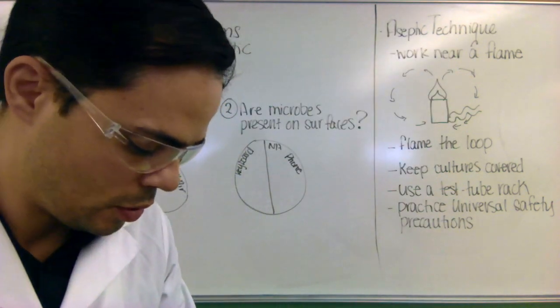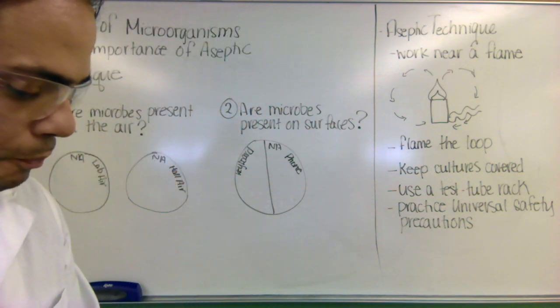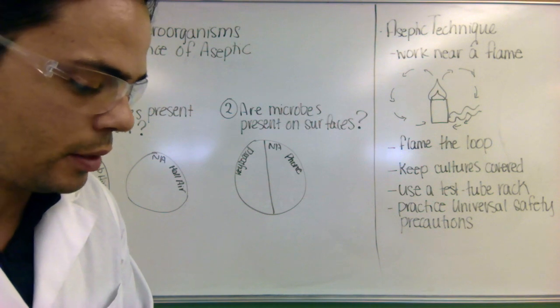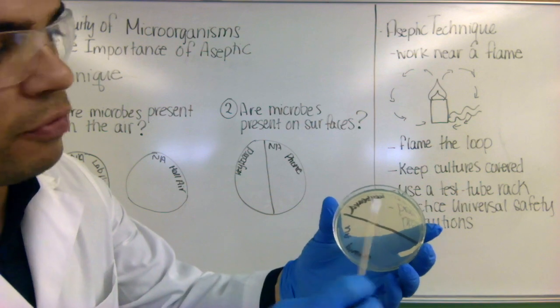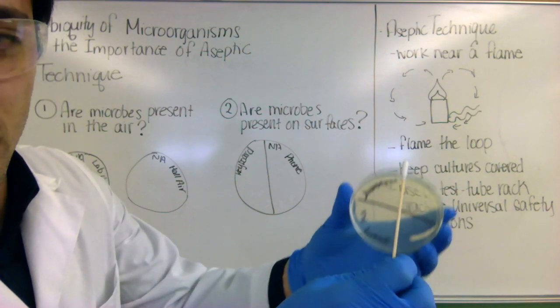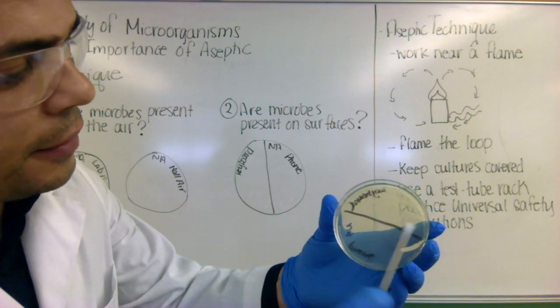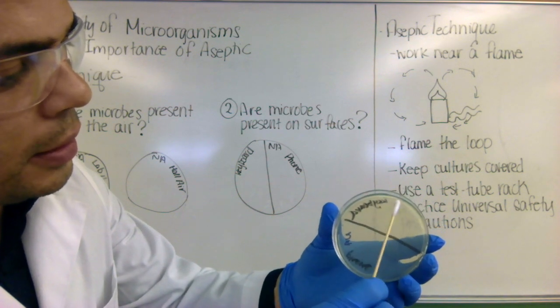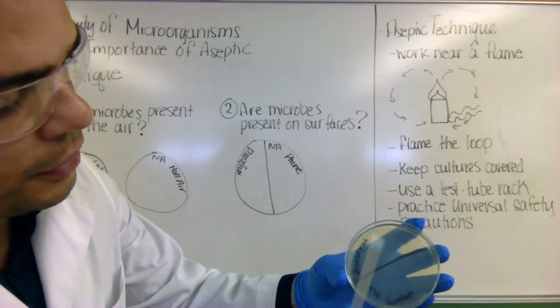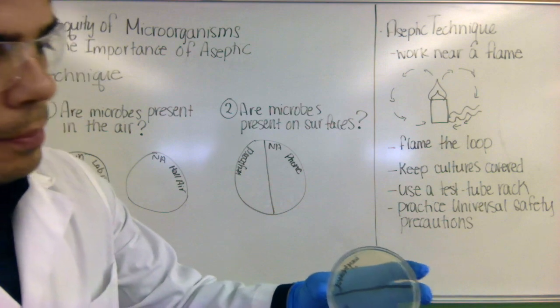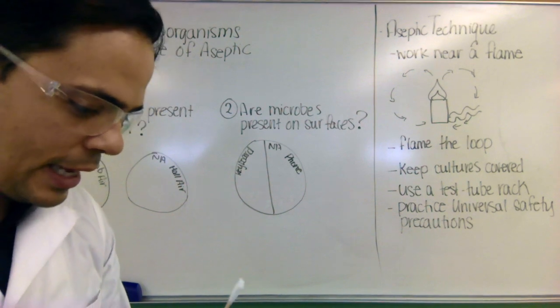So what I'm going to do is pick up my plate. And again, you would want to open this plate next to a flame to ensure that it's not contaminated by the air. But I'm just going to do it here so you can see. So what I'm going to do is I'm just going to go back and forth on the side that says keyboard. And as I'm doing that, I'm going to twirl. So I get all the bacteria from all sides onto the plate. So I'm going to go like this, and then I'm going to twirl it, go back, twirl it, and turn the plate a little bit and go back. Now stay on the correct side so that you're not invading the other side that we're going to use for the phone. So that now is done for that side.